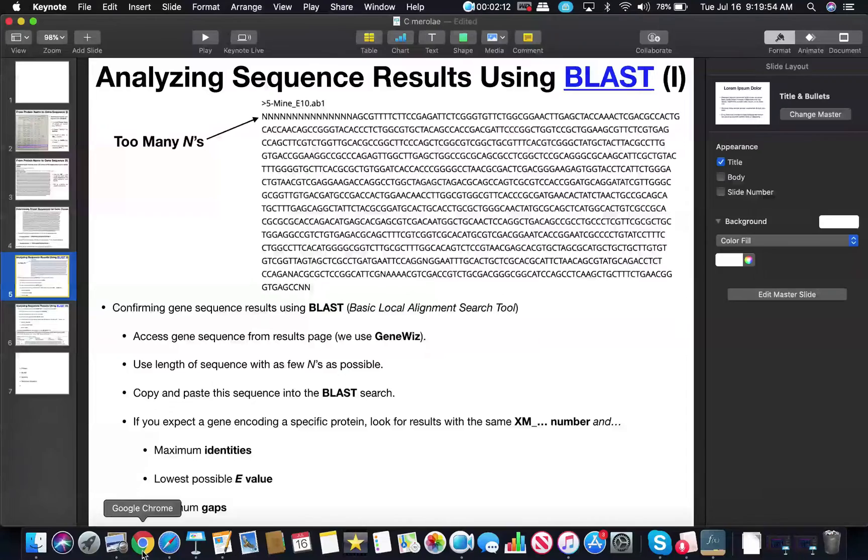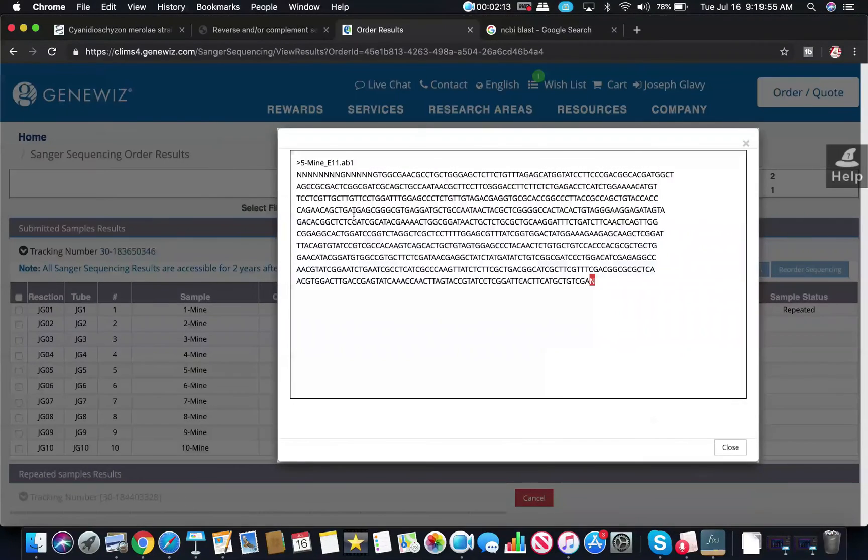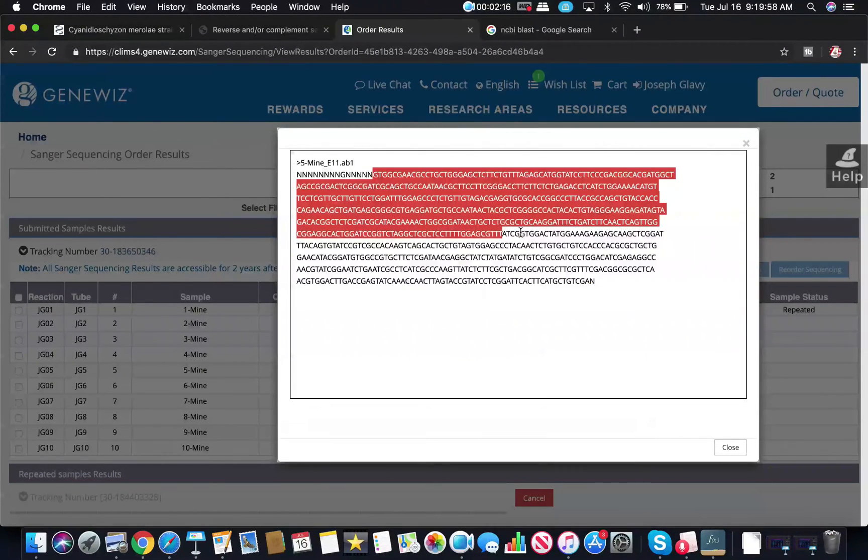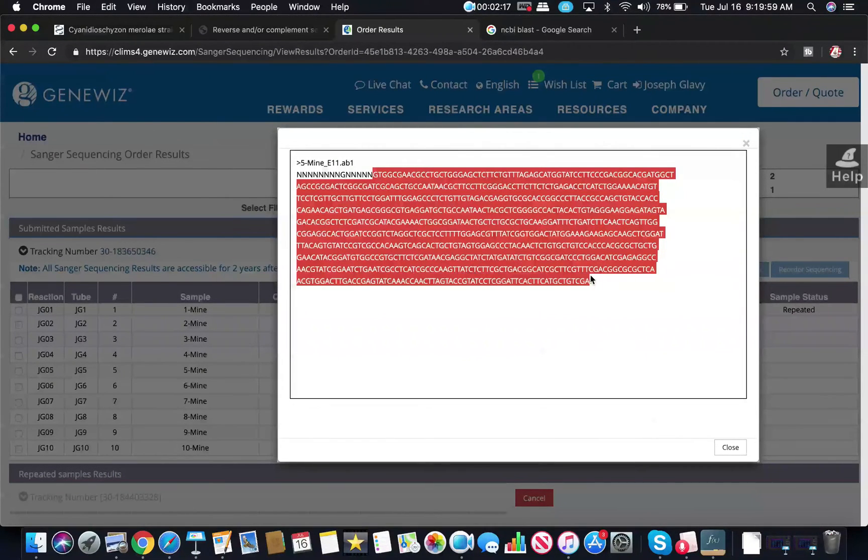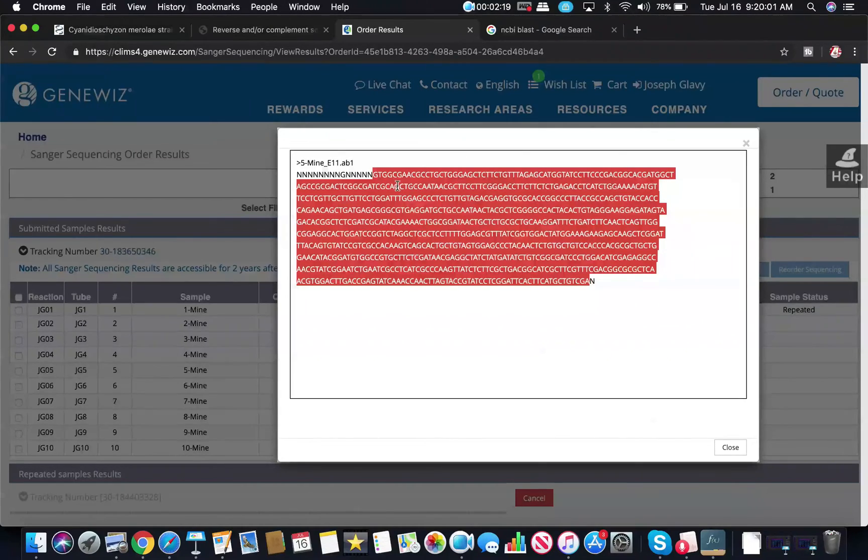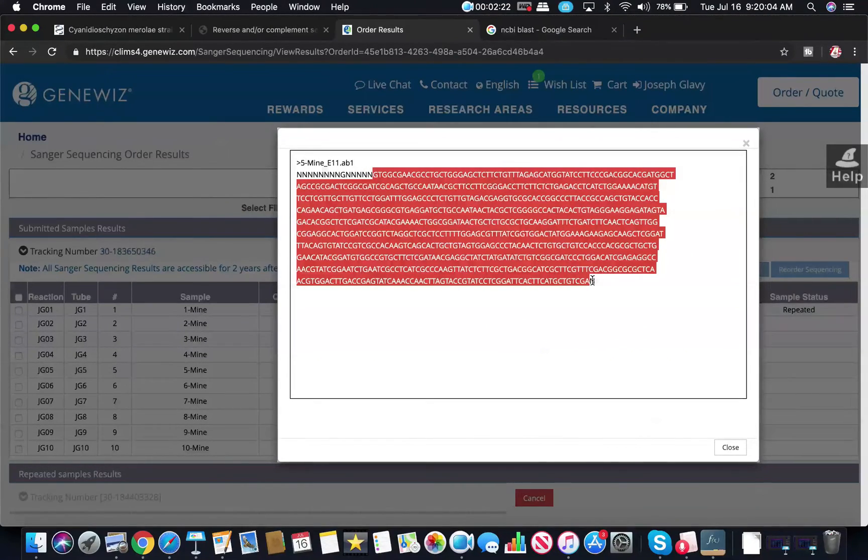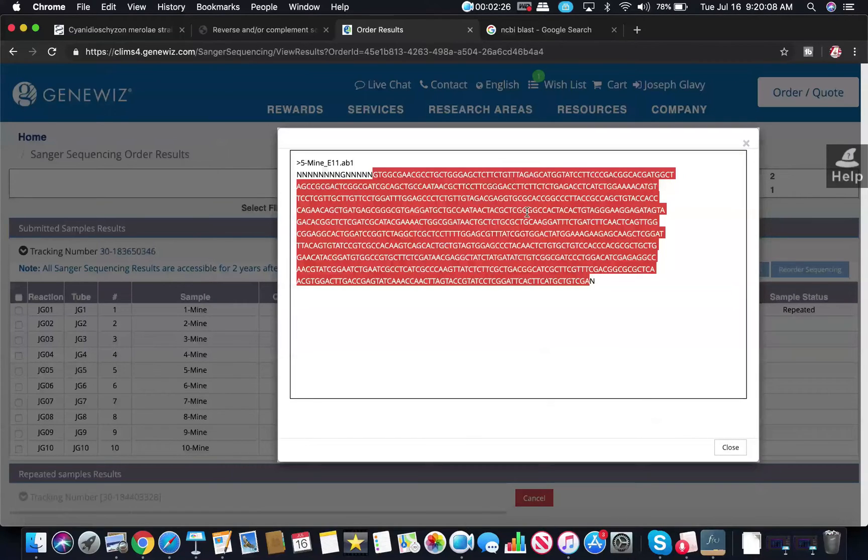So I would go to GeneWiz and I would just take a segment maybe from here to there. Notice that cuts out all these N's at the beginning and then it removes the one at the end, and then I can copy and paste this into the BLAST sequence.